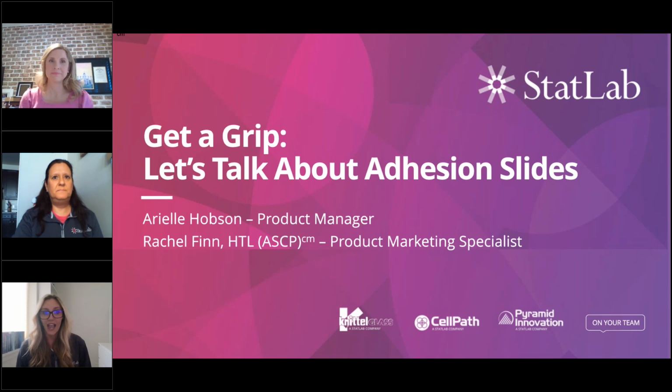I'm sure all of you have thought at some point, which is probably why you joined the webinar, if you're doing something wrong during staining or when you run into inconsistent stain results. We're here to tell you it's probably not you, it's most likely your slide. Today we are going to walk you through the different types of adhesion slides and learn the key differences in adhesion properties, how adhesion affects background staining, and how choosing the right slide for your specific applications can impact your results.